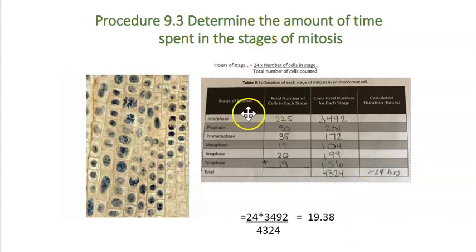And what this is going to hopefully show you is that most of the time the plant is going to spend, really the cells are in interphase. Organisms don't divide just to divide. They divide when they need to, or when they're chemically cued to, for different reasons. Again, whether it's growth and development, whether it's repair. But cell division is not just a process that just happens. Actually, if we lose control of cell division, it can cause some very, very big problems.